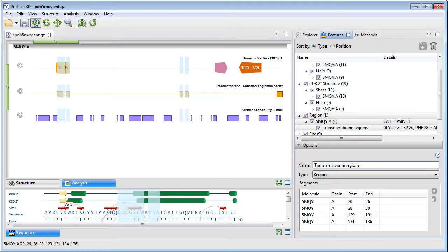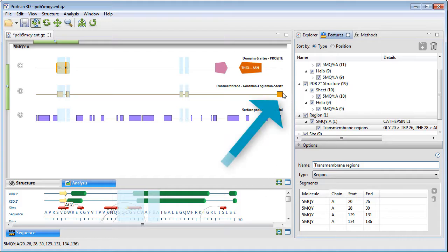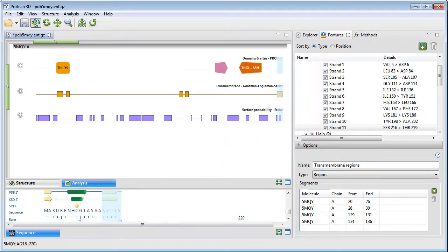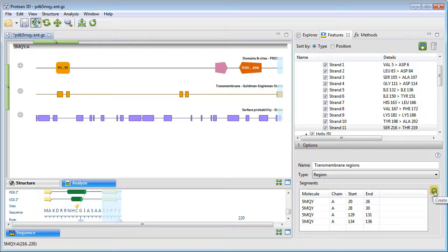To add an additional segment, I'm going to click on this last transmembrane region and then press the Create a Segment tool.